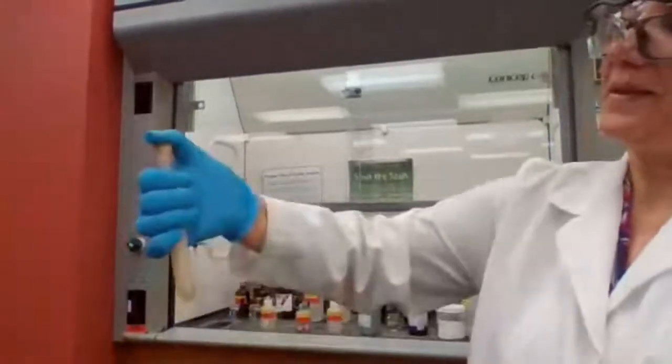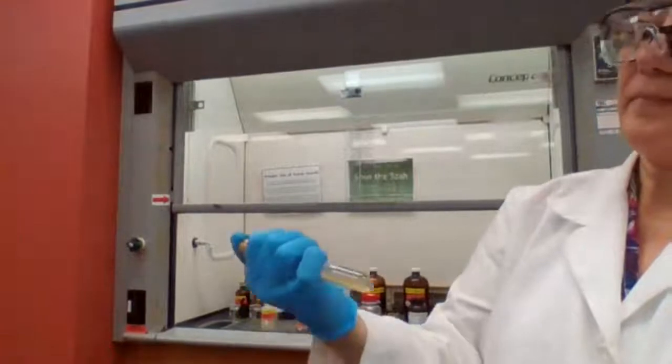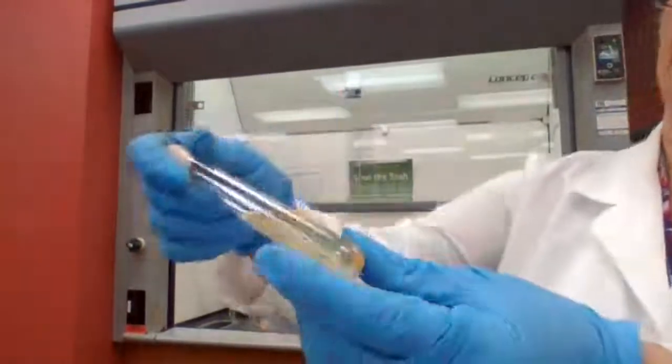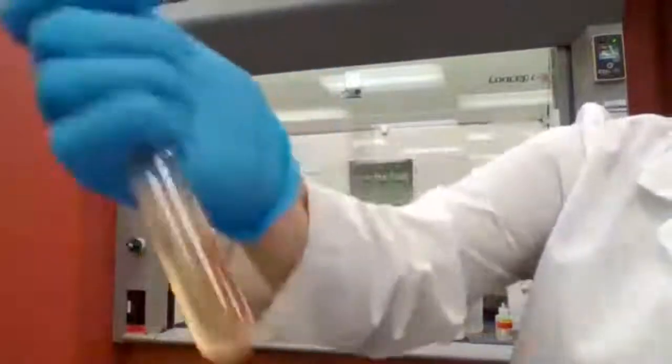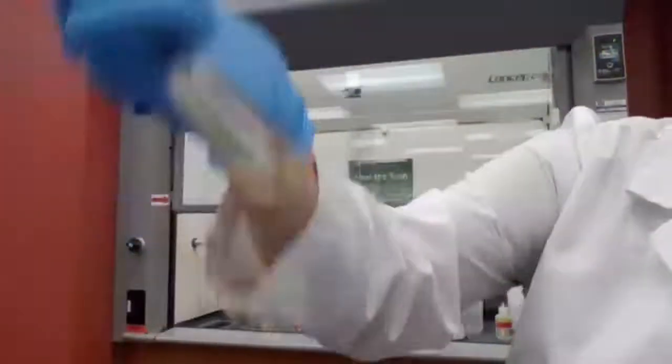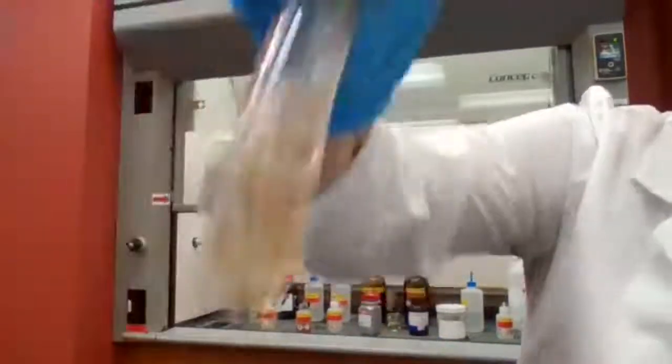Are you still in the same? Okay. Do you see some precipitate that formed here or no? When I'm mixing, you could see the particles. Can you see the particles now?